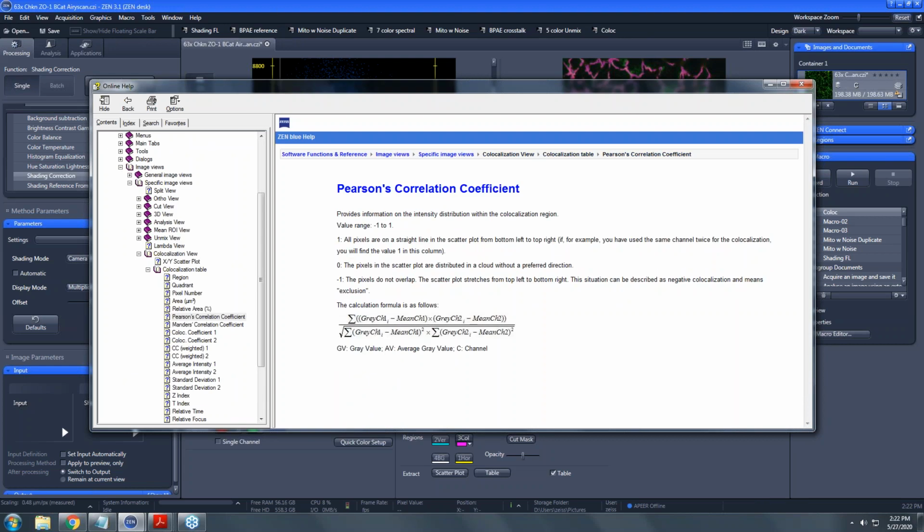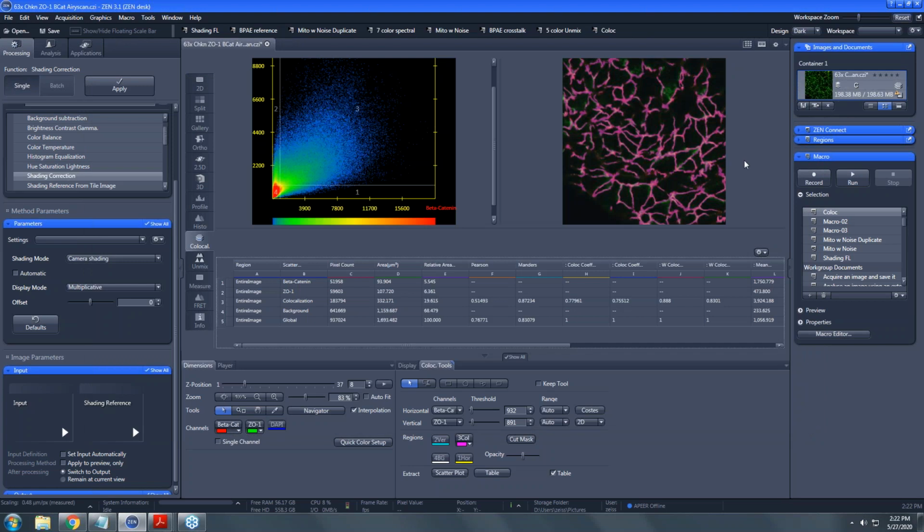And thank you for bringing that up, Nicole, because in anticipation that this is a question, of course, as to what do these things mean and how do I use them, I've added a review publication to the handouts. So in addition to our cleaning and disinfecting your microscope handout, we've got evaluating colocalization that will do some description of what these statistics are.